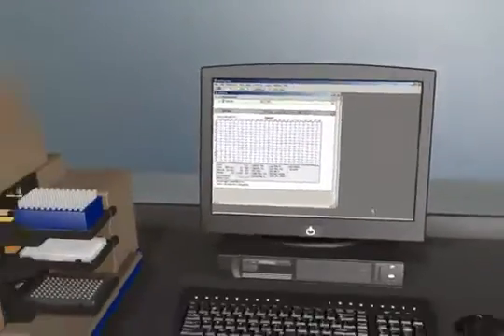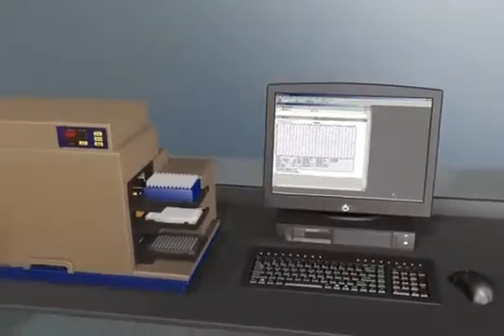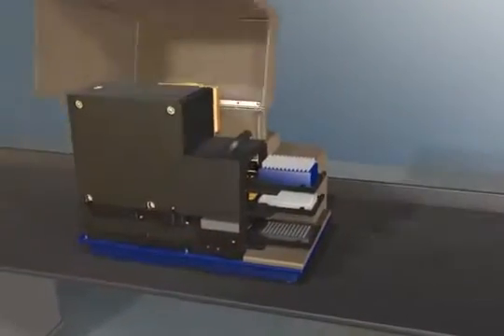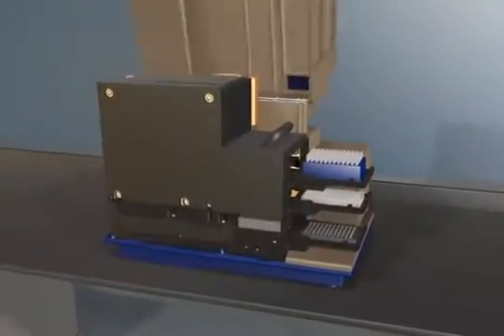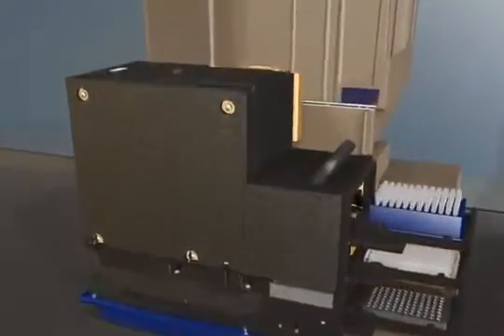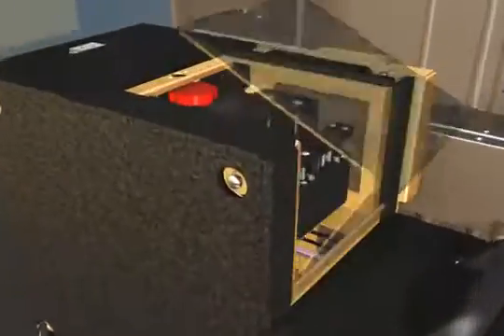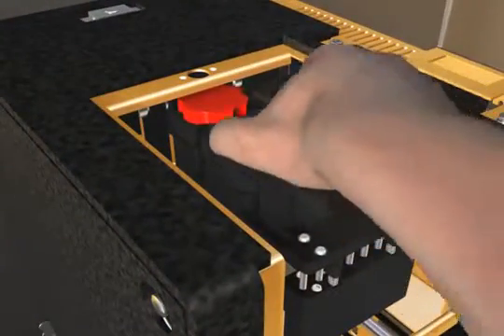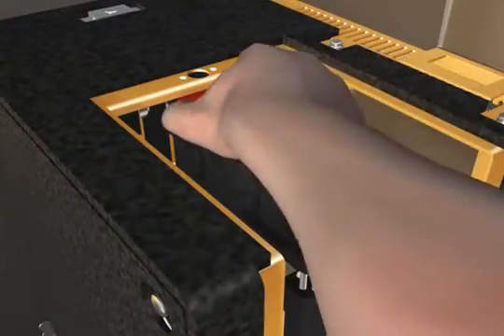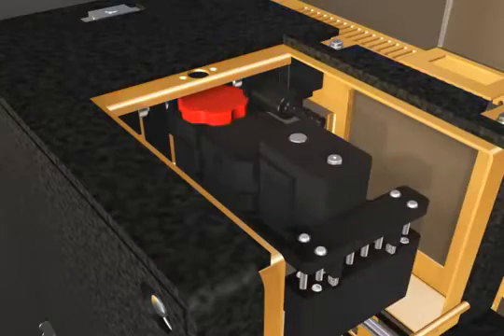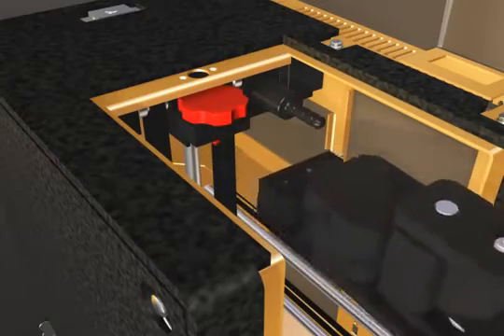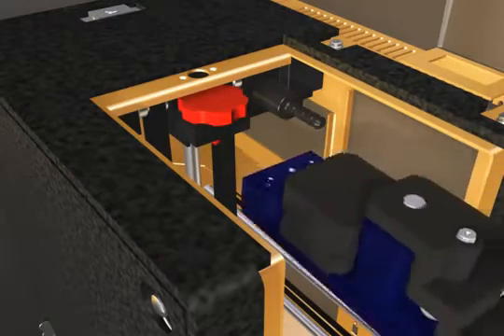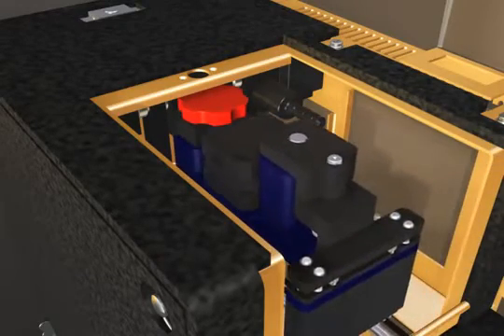To improve assay quality and increase throughput, the FlexStation 3 system offers automated pipetting using a pipetter head with 8 or 16 channels. The pipetter head is user interchangeable, so you can switch between 8 channel and 16 channel pipetting as your throughput needs change.